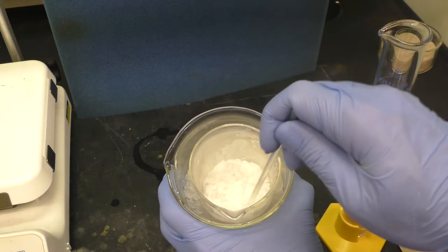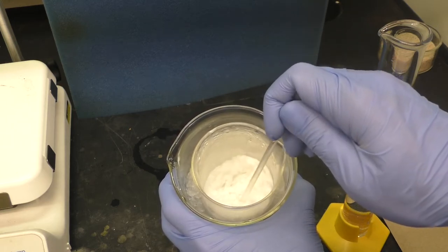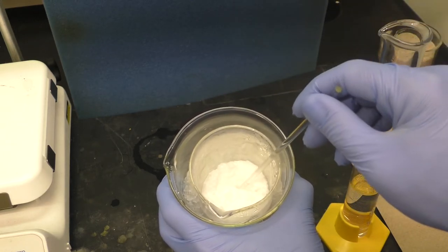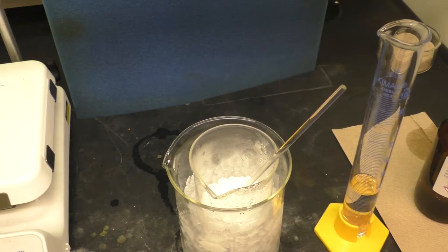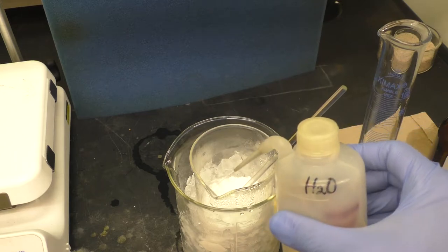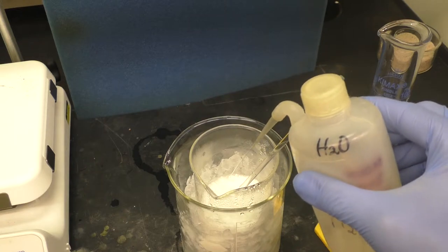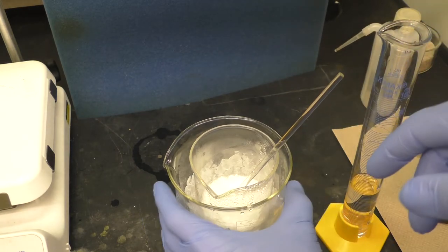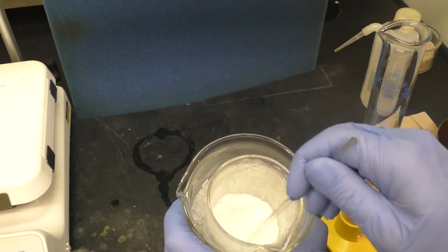See the fuming that's occurring as I add this. It's because of the very rapid and strong reaction between the very strong base and the very strong acid. So I'll actually use a little bit of distilled water here just to carefully rinse some of this solid down. I've only added a little bit of the sulfuric acid. I'll be very careful and do this in the ice bath and very slowly. You can already see I've formed a lot of this solid product.